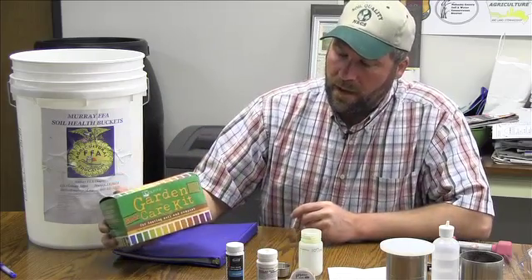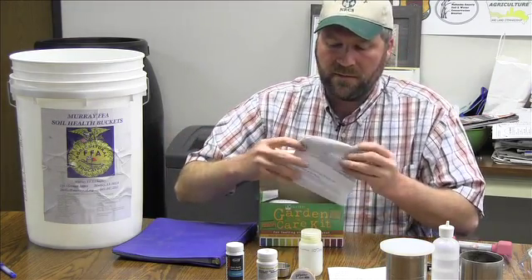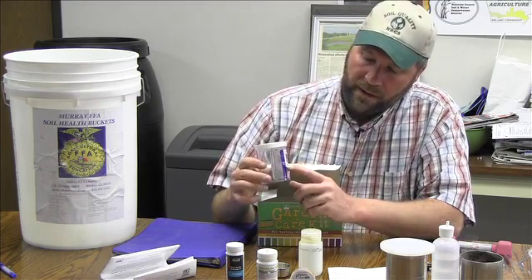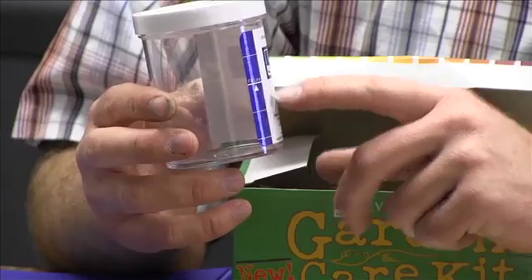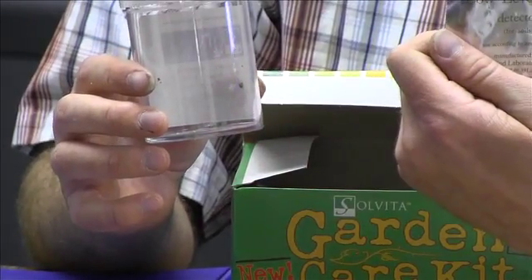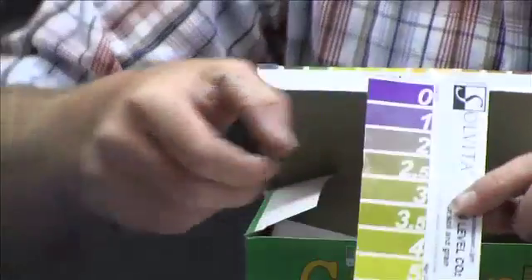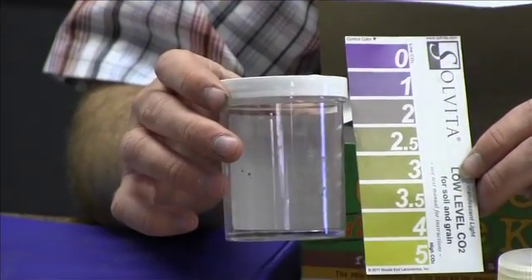The last biological chemical property test is the Solvita test. There are directions for the Solvita test located inside the box, and there are two jars to collect your Solvita soil samples in. You can notice there is a fill line on these bottles — that's where you want to fill the soil level to. When you put your placard in from the foil bags, stick the placard so you can see it on the back side of the bottle, where you have the nice clear glass. That makes it a lot easier to read your color chart — just put the color chart right up next to the bottle, and that's the best way to read it without taking the lid off.